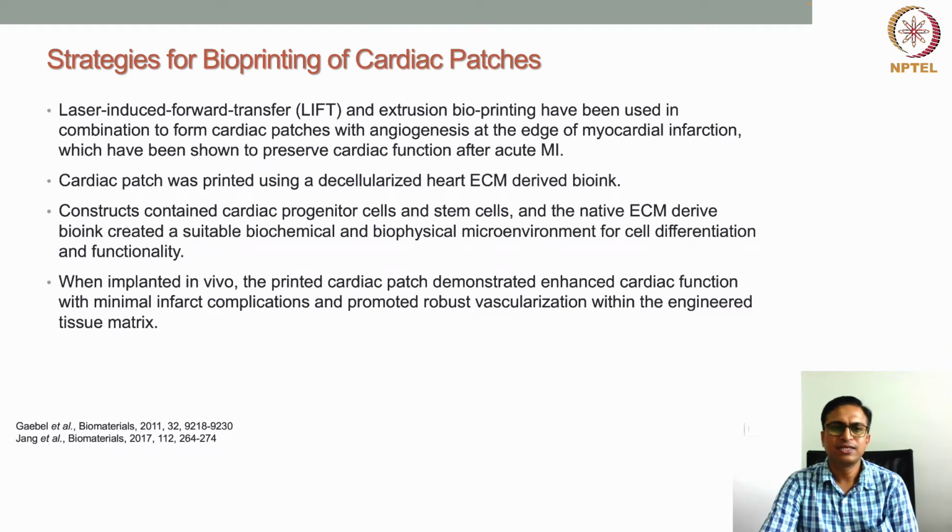The other thing is the strategies for bioprinting of cardiac patches. There are several studies where researchers have tried to replicate the anatomical structure of the muscle, with or without embedded vasculature. That can be used as a cardiac patch for people with myocardial infarction. In case of myocardial infarction, when a part of the muscle is injured or dead, it can be replaced with the bioprinted cardiac patch.